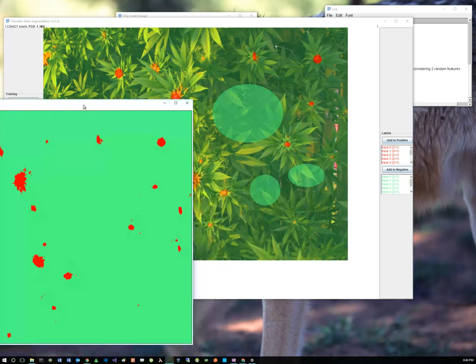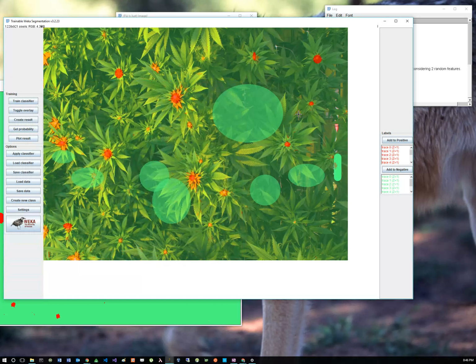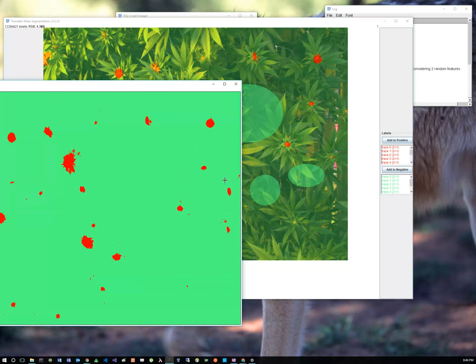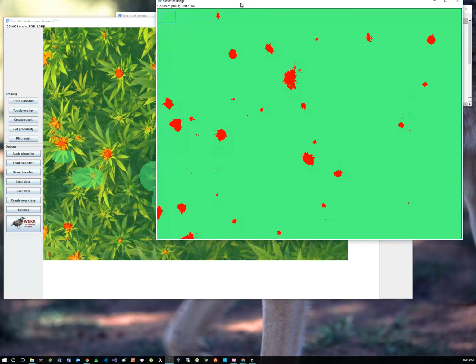And everything that's in general longish, like for example, this here, these are just parts of the pipe. So we need to brush this away as well. This small dot, however, is clearly a pixel, a bud identified by our classifier, so we need to keep that. And this needs to go. All right, so it looks fairly good.